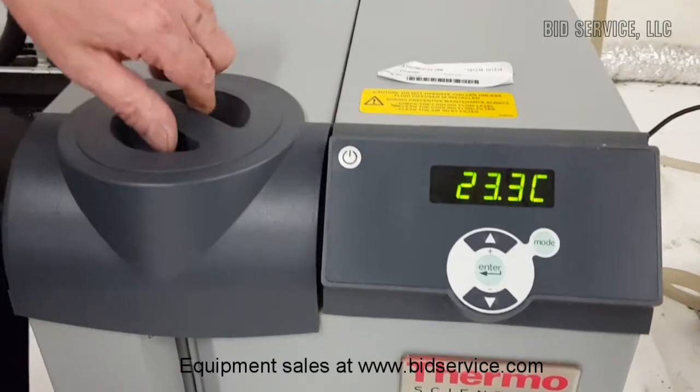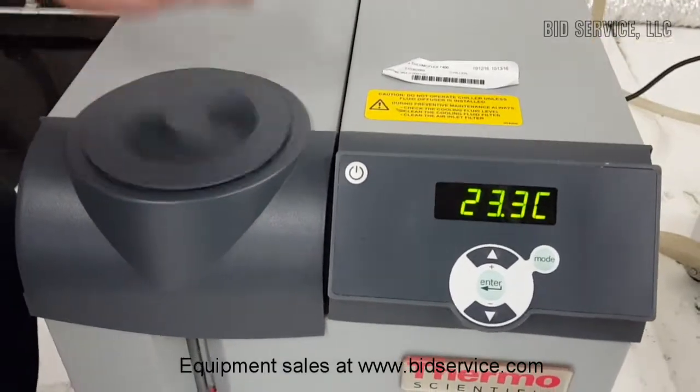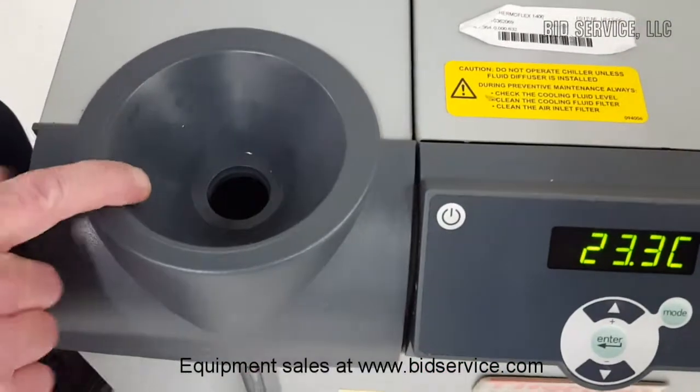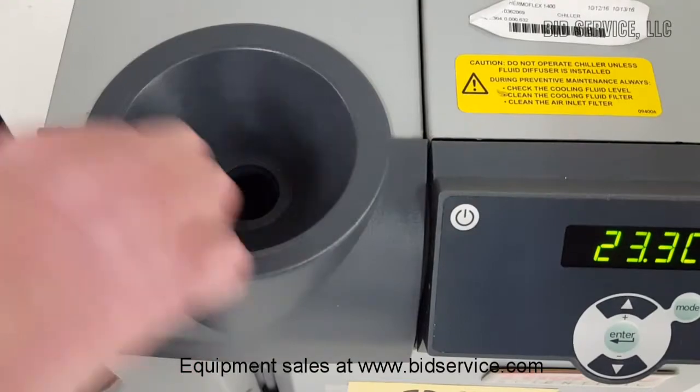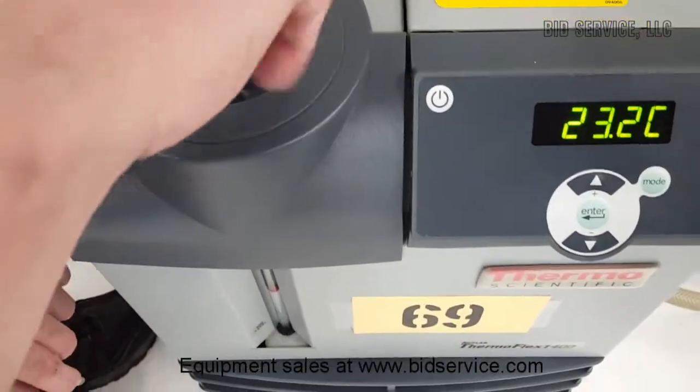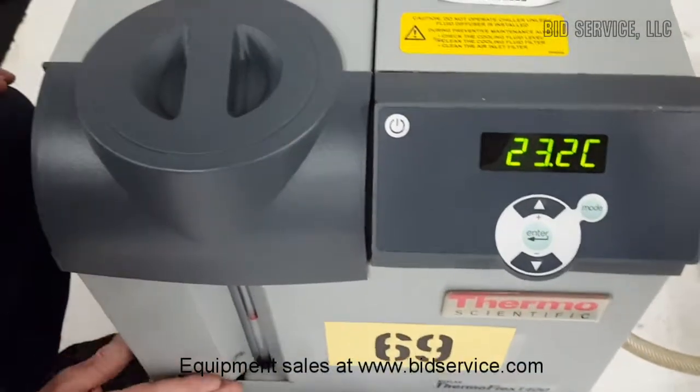It has a 1.9-gallon reservoir. This is how you fill the reservoir — it has a built-in funnel, which is very convenient. The sight glass is easy to see.